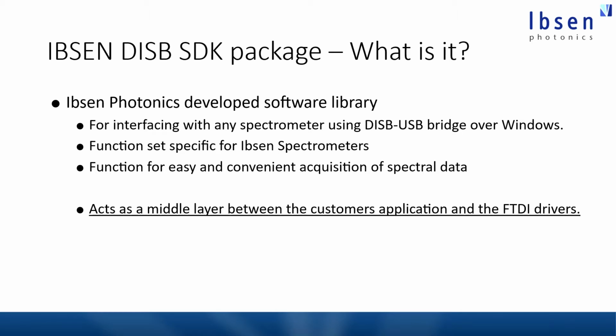The package contains a set of specific functions that can be used for Ibsen spectrometers. And the idea here is to make it very easy and convenient to acquire spectral data and adjust different parameters of a spectrometer from Ibsen. It essentially acts as a middle layer between the customer applications and the FTDI drivers that are used to control the USB connected FTDI bridge board.